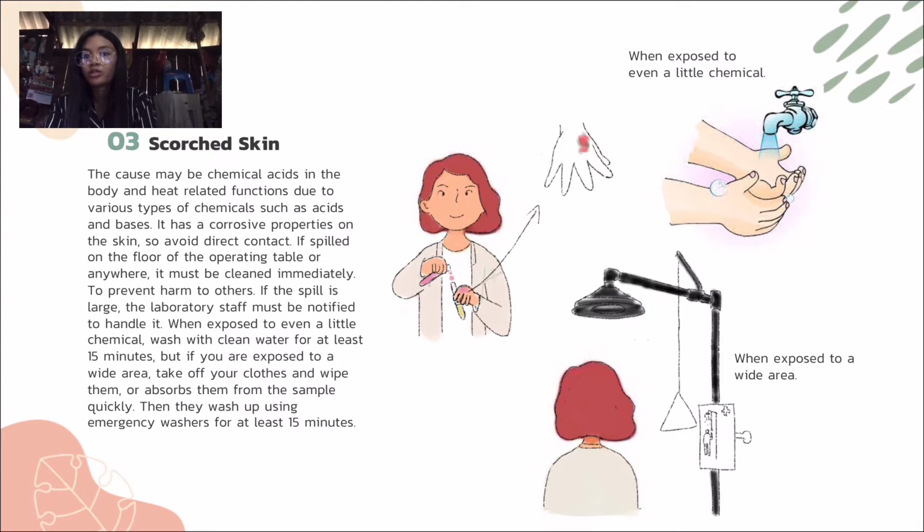When exposed to even a little chemical, wash with clean water for at least 15 minutes. But if you are exposed over a wide area, take off your clothes and wipe or absorb the sample off quickly. Then wash using the emergency shower for at least 15 minutes.